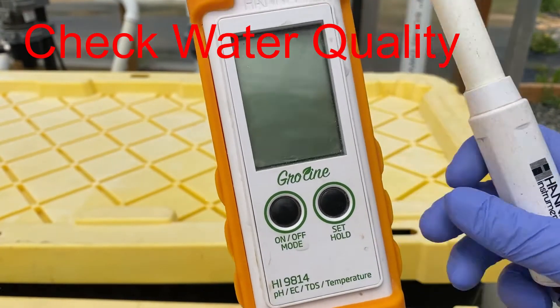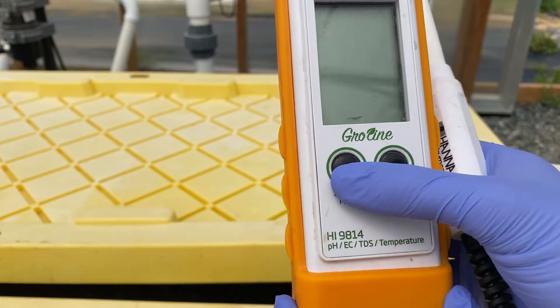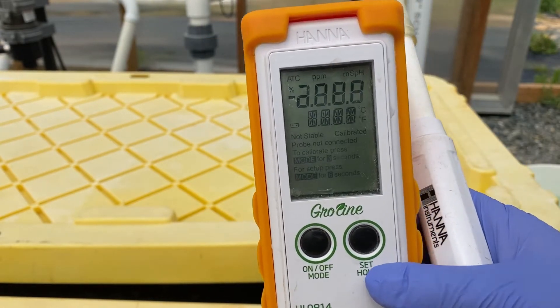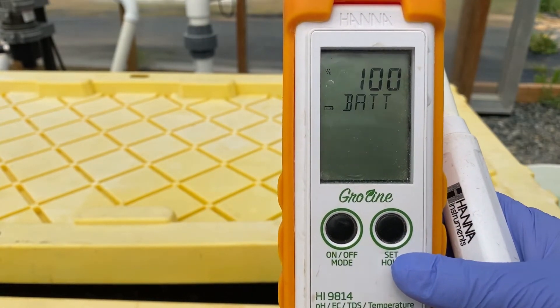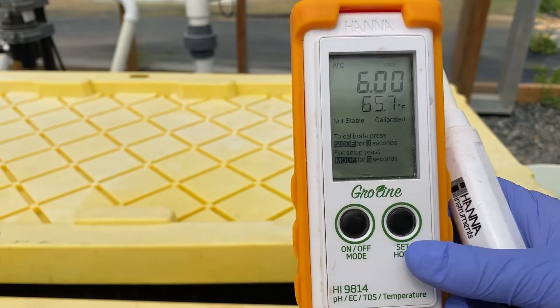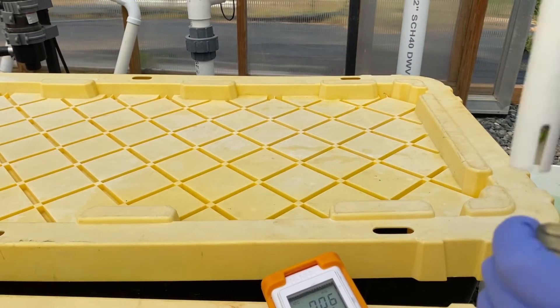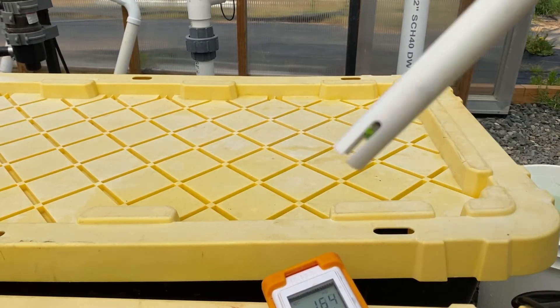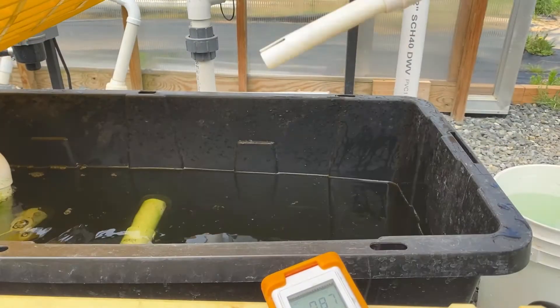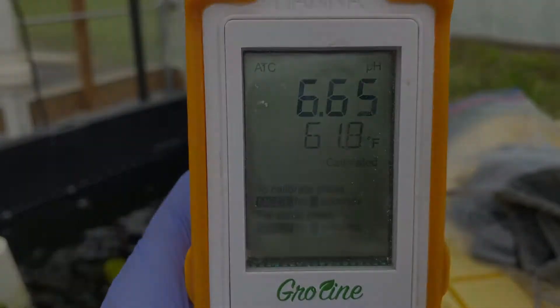Once your tank is full, you'll use your selected probe to measure your pH, electrical conductivity, and temperature. For this probe, you'll turn it on and then take off the clear cap, which has a storage solution within it. Place the probe in the bin you wish to test and take readings to assess your water quality.